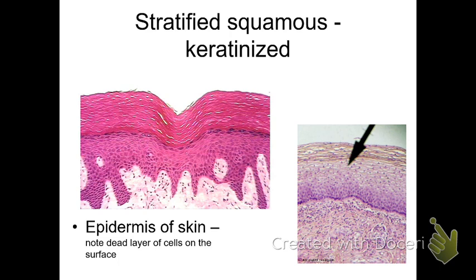And for the first time now, we're going to see a much less flat basement membrane. So here comes the basement membrane. And you can see it kind of moving around here, up and down, up and down, up and down. Okay. Below it is connective tissue. And above that basement membrane, we see lots and lots of layers of cells.